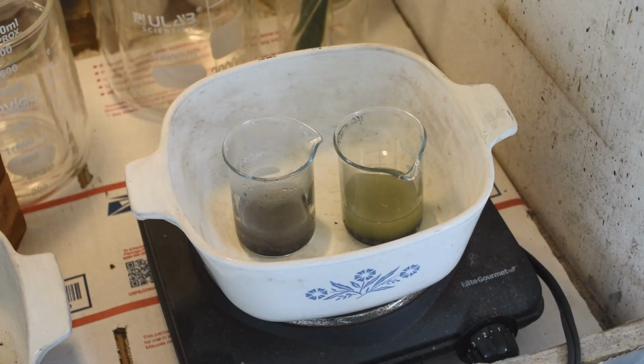Now to my eye, the sulfuric acid has been reacting a lot stronger than the hydrochloric. So, decisions. Now there is some reaction with the hydrochloric though, especially as they both heat up on the hot plate here. Adding the sulfuric acid to this causes it to heat up immediately, whereas this has needed time to heat up. Well, anyway, I'm just going to let them go for a little while and try and gauge which one's doing a better job.